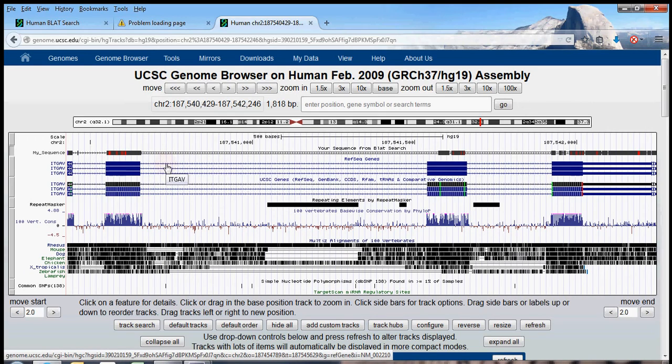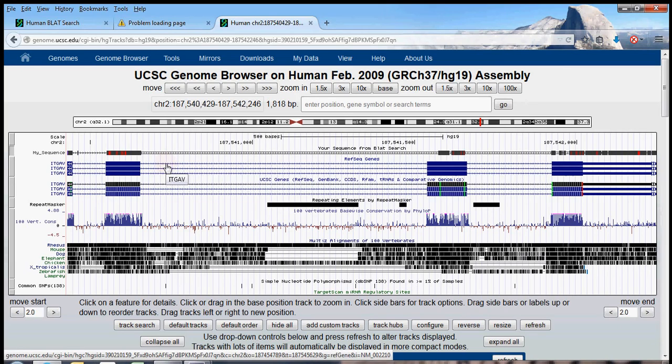And I must admit, this was not the gene that I expected this sequence to come from. So I'm very glad that I BLATed it, otherwise I would be working with the wrong DNA. And that would be bad.